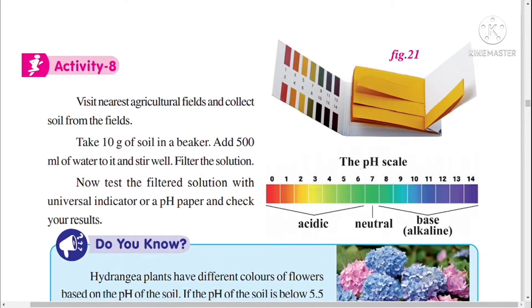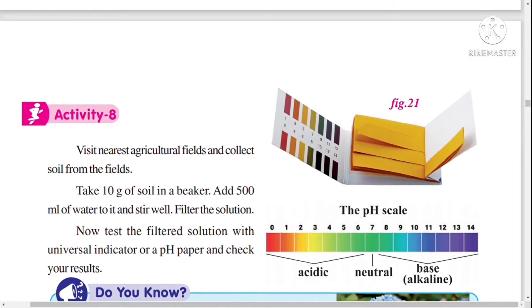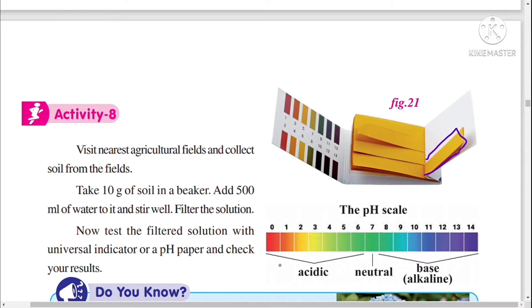This is the pH scale. pH strips look like this — the paper is yellow in color. This is a pH strip. When we keep this paper in any acid solution or base solution, it will turn into a different color. The change of color decides whether it is an acid or a base.